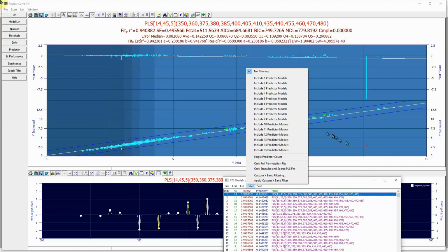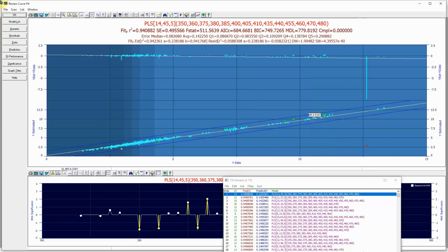If we look at just the prediction performance in the plot, we see this one massive outlier. It's not a surprise. It's that S230 replica 3 spectra we found visually prior to fitting. This outlier is significantly degrading the R-squared goodness of prediction metric.